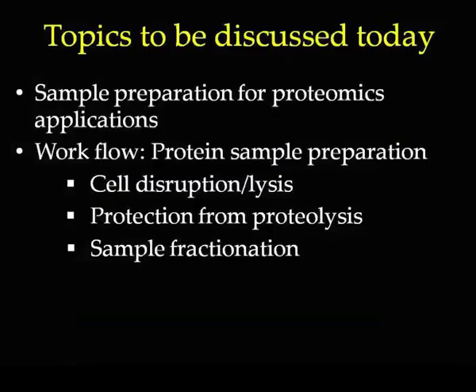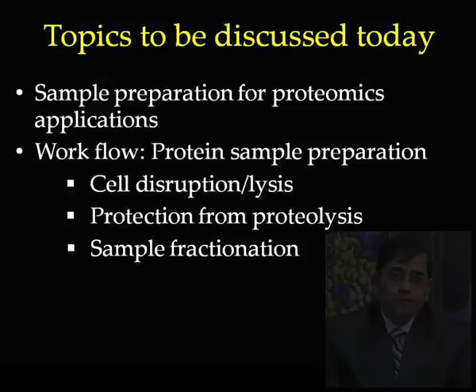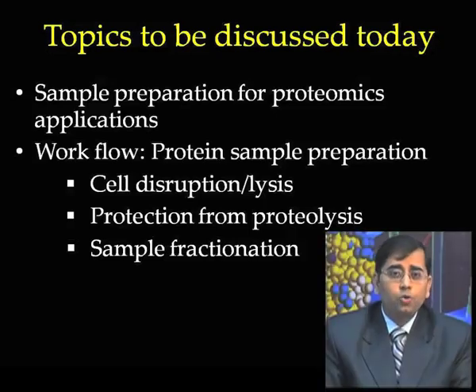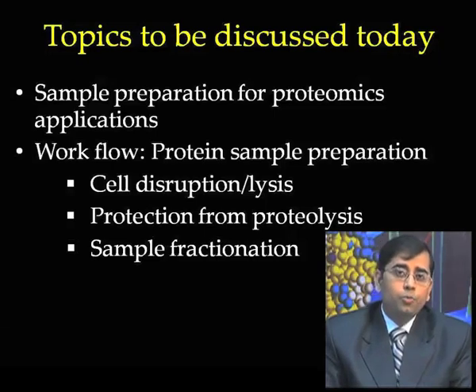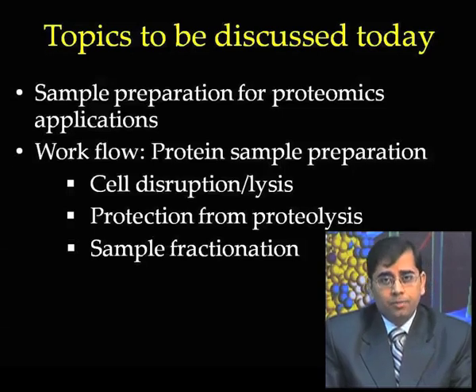In today's lecture, we will talk about the sample preparation for proteomics application. I will give you a workflow for protein sample preparation: the first step, how to disrupt the cell, how to lyse them, how to protect the cells during the lysis step so that there is no proteolysis occurring, and how to fractionate the samples.